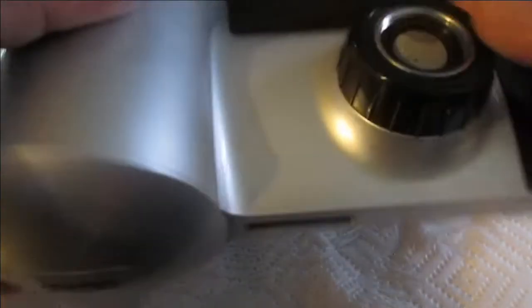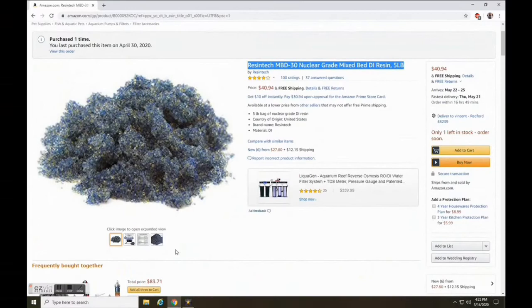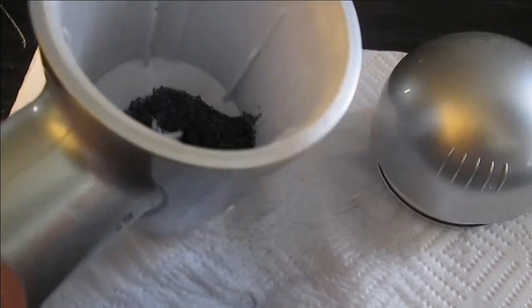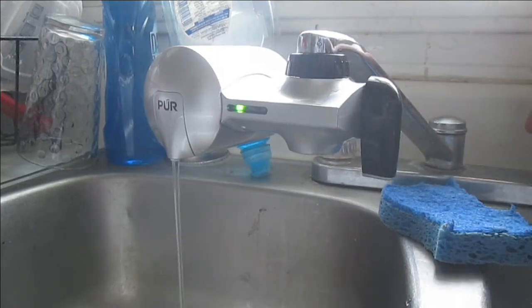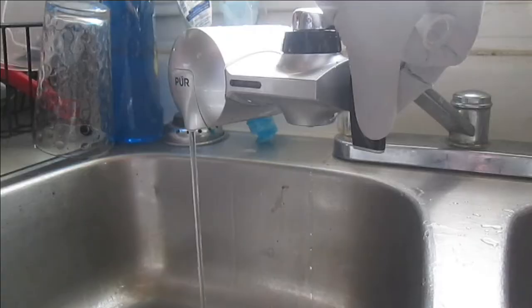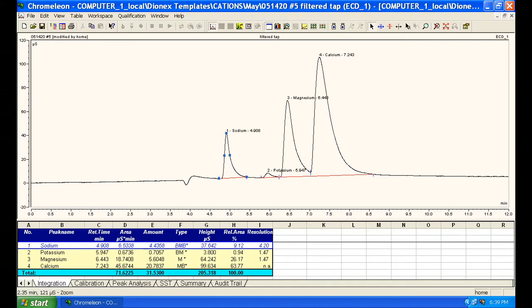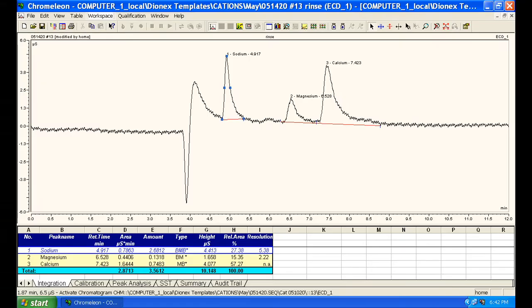The water filtration system has a cartridge containing what I suspect to be nothing more than activated carbon, which is fancy talk for powdered charcoal. I removed it and replaced it with nuclear grade mixed bed resin available on Amazon — 5 pounds for $40. With a bit of cotton balls I can keep the resin from leaving the filter, then add the mixed bed before trying it out. With more cotton balls to restrict the flow and allow full contact between resin and water, I was able to reduce the concentration of calcium, magnesium, and potassium down to a few ppm or lower. Sodium is very hard to get rid of, but the longer the water is in contact with the resin, the better it gets — even down to my deionized water level.